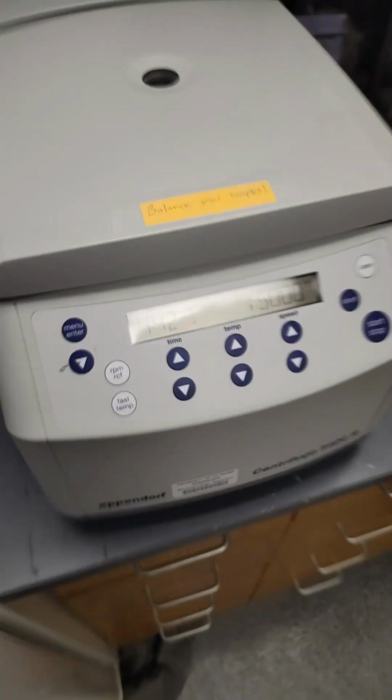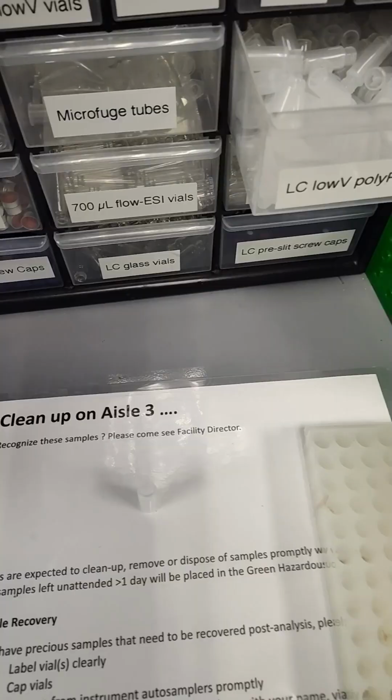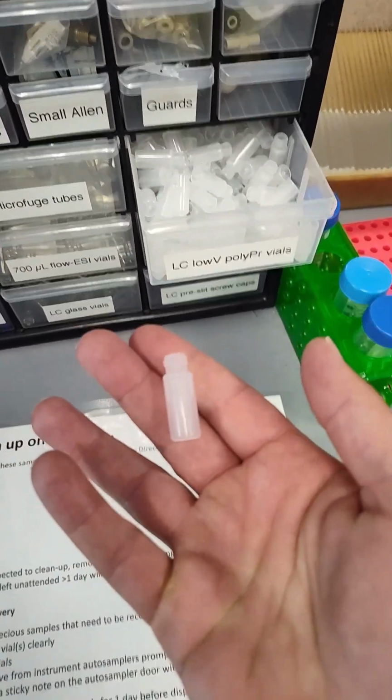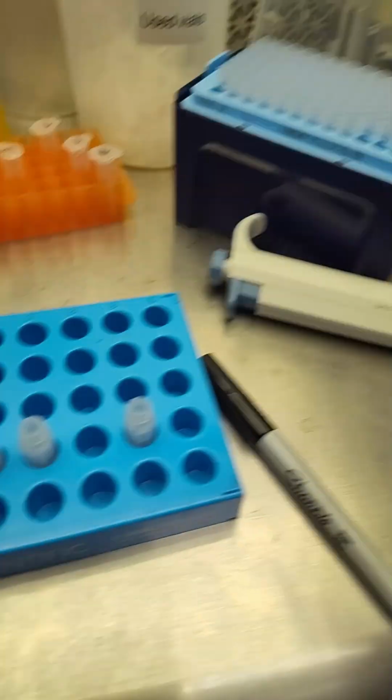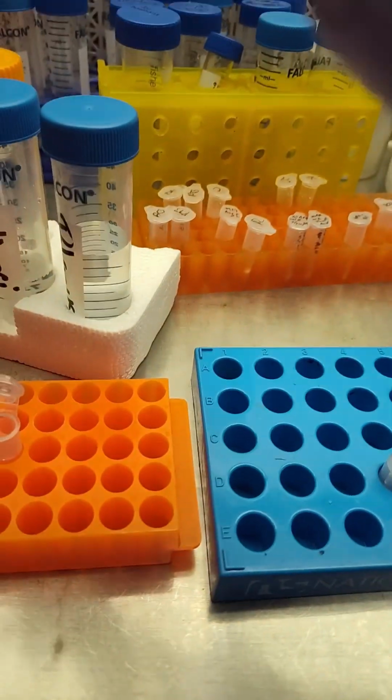And I'm gonna go 5 minutes. All right, we're gonna go low volume plastic tube. It's because they're the cheapest. All right, so I'm gonna go 200 microliters per tube. You know, these are insert tubes. They only hold about 200 microliters.